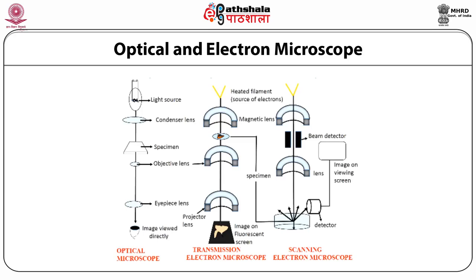The wavelength of an electron is thousands of times shorter than that of visible light, enabling electron microscopes to resolve this issue and provide better magnification to image objects at very low dimensions. Hence, electron microscopes can be used to visualize inorganic, metallic, organic, and biomolecular entities at atomic scale resolution.